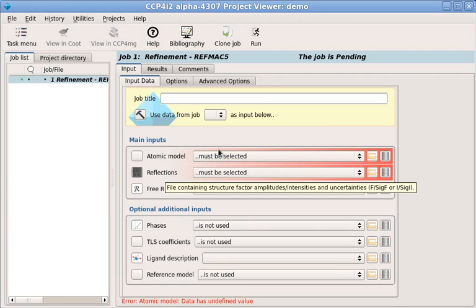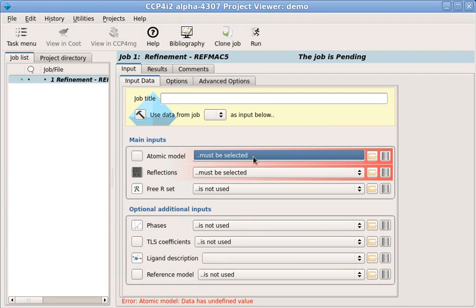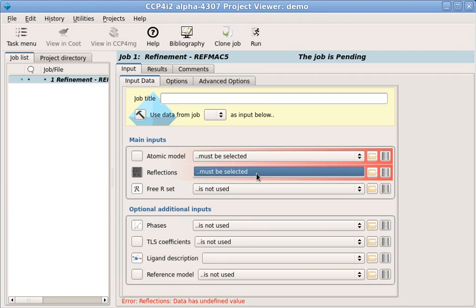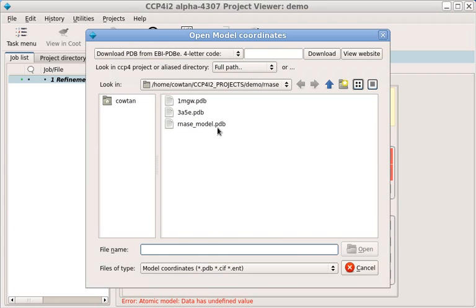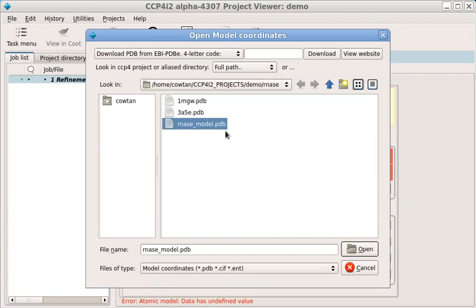Normally, these menus will allow you to select data which is already in the database. But this is our first job, so we need to import some data. To do this, we use the small file button on the right. First, we'll select the atomic model.